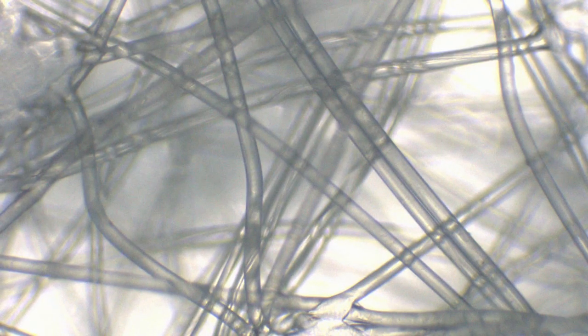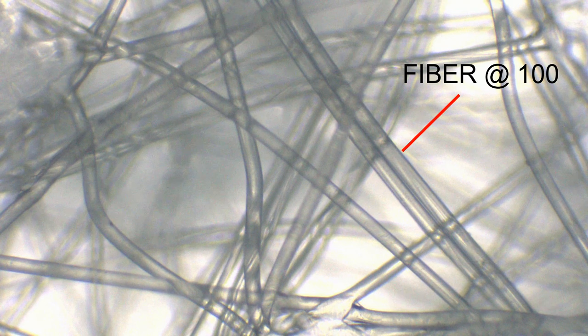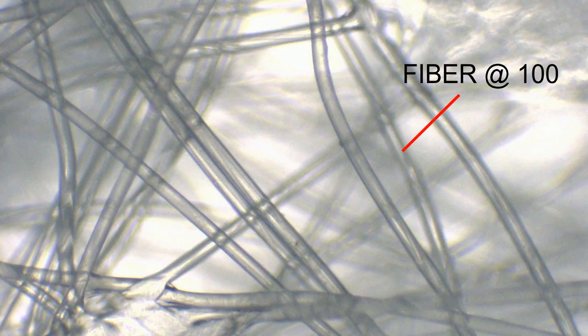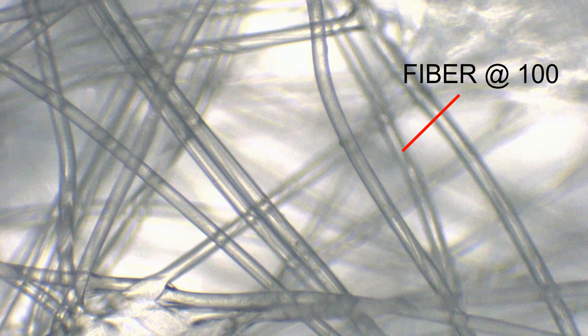When the fibers are very close, they will be able to stop particles of smaller size. If they are farther away, they won't be able to stop the particles of smaller size.